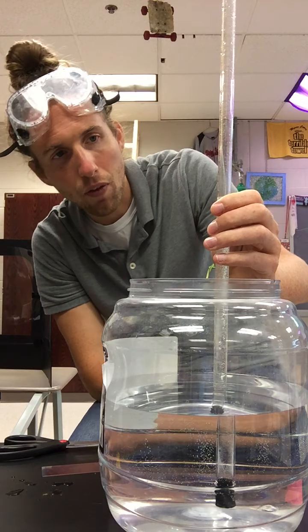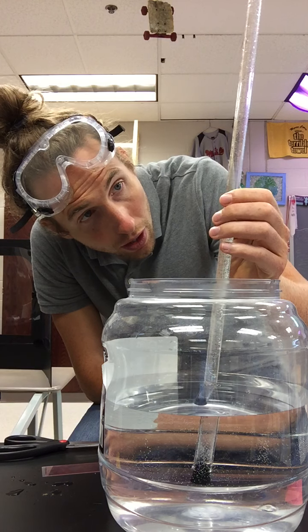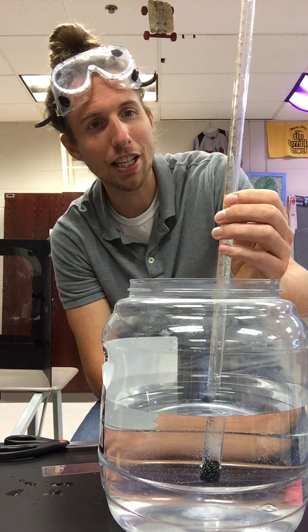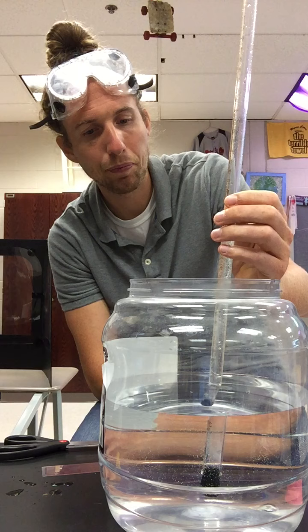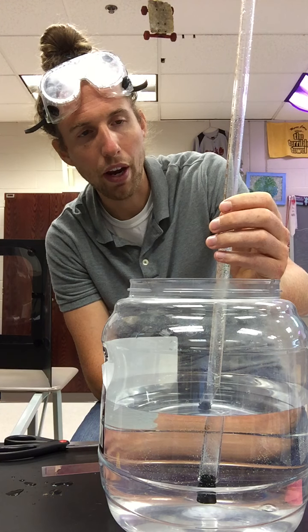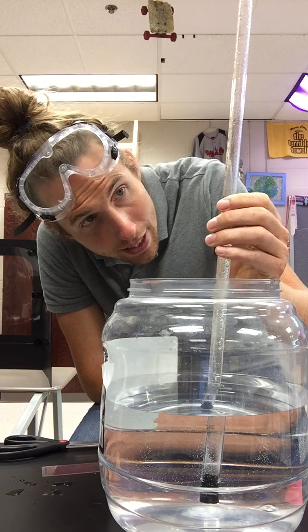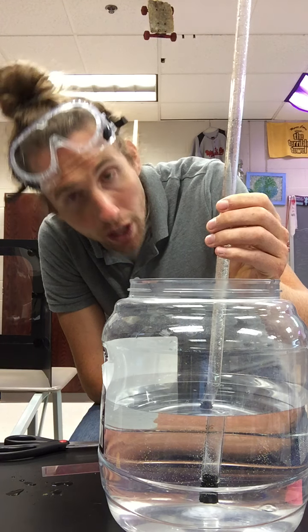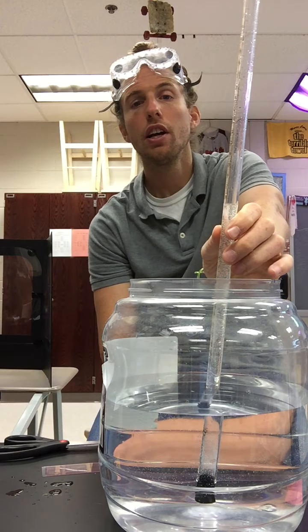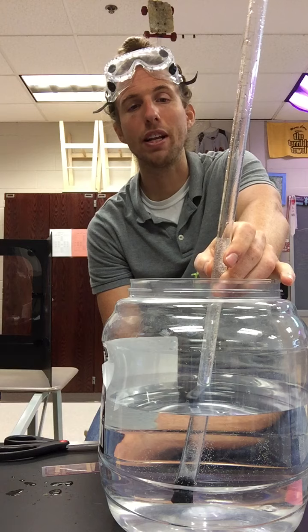When I get down here and I read my meniscus, we are in the neighborhood of, oh, there's just a tiny piece of magnesium still reacting. Let me let that finish. We are down in the neighborhood of 28.61. So your volume of hydrogen collected is 28.61.